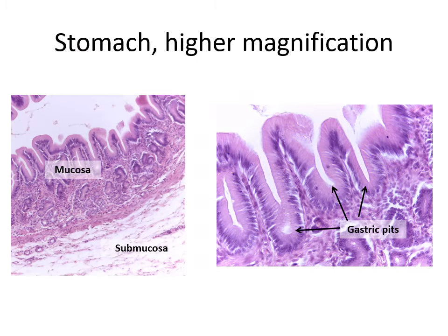If we take a closer look we can again see those gastric pits where things dive down in. What we can't see very well on this slide are the goblet cells that produce mucus, which are really important as a defense for the stomach against the acid that it secretes.